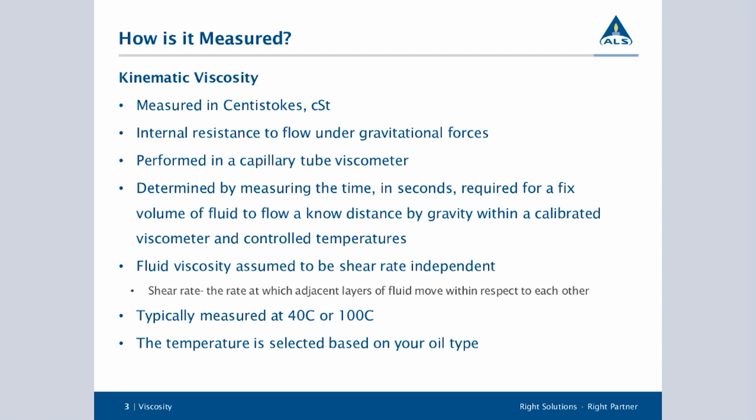And the temperature is controlled, because you don't want to come into something and just be like, well, today I decided to measure it at 38 degrees, and tomorrow I'm going to do it at 37 and hope that the kinematic viscosity is still the same. If you control that temperature, then you can control your centistokes and your data and know that it's comparable. That's what we really get into: you want to be able to trend your history in oil. Having those controlled variables helps with that.